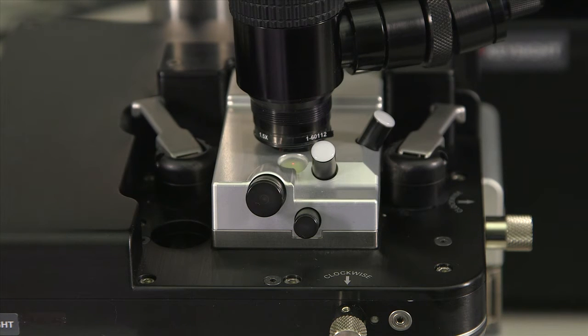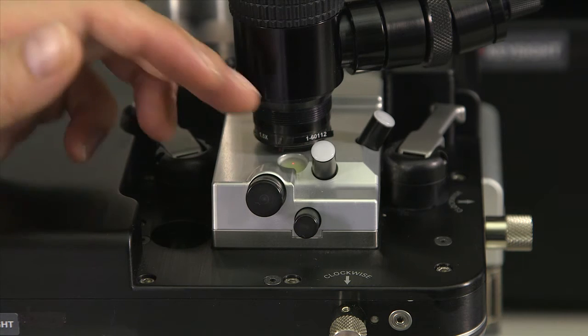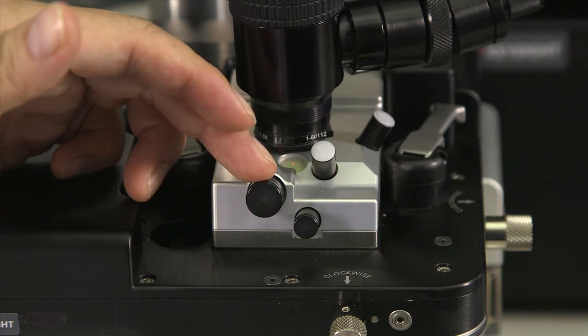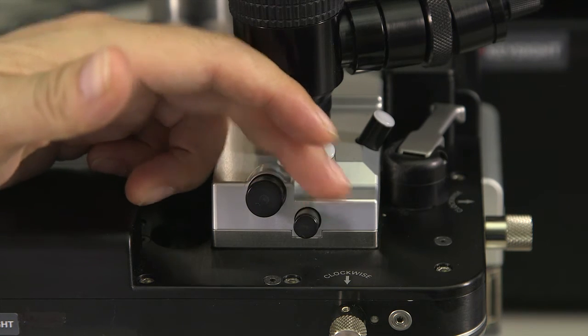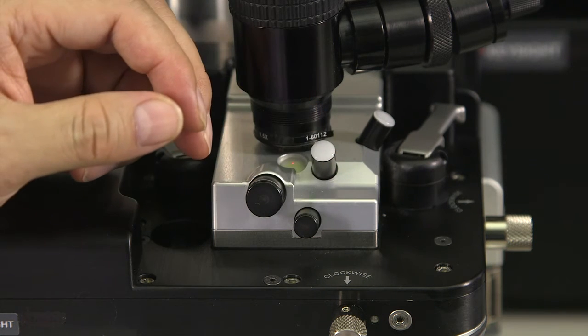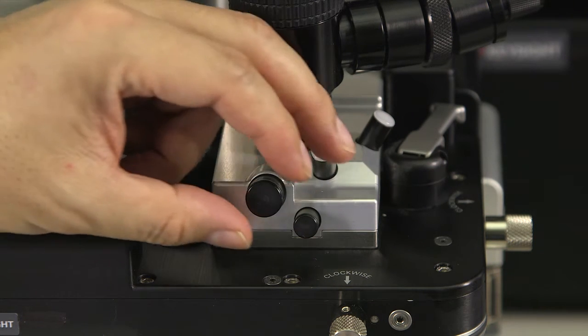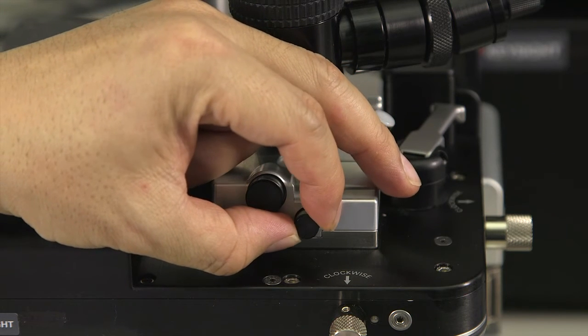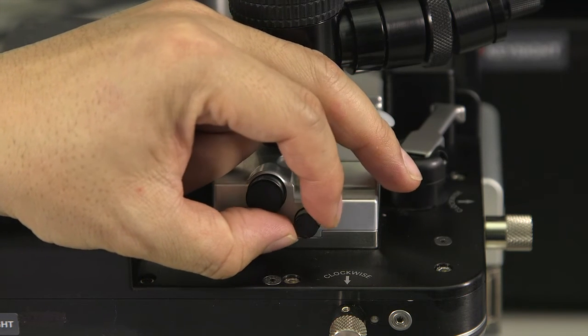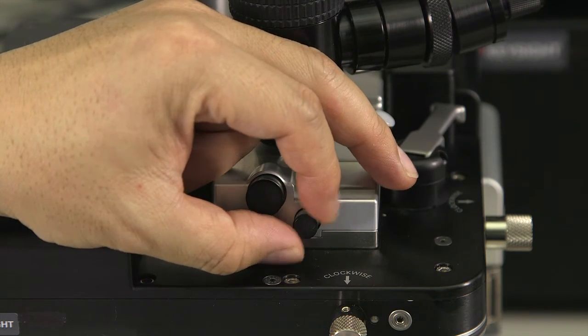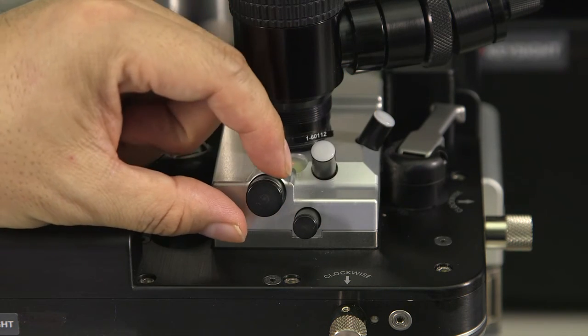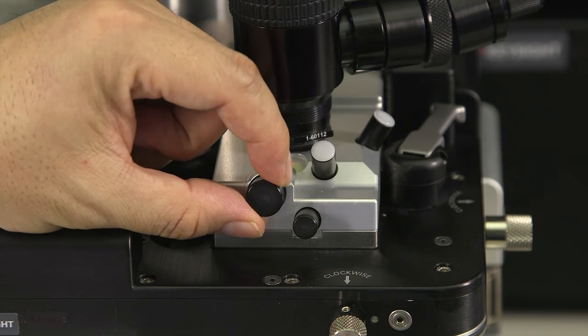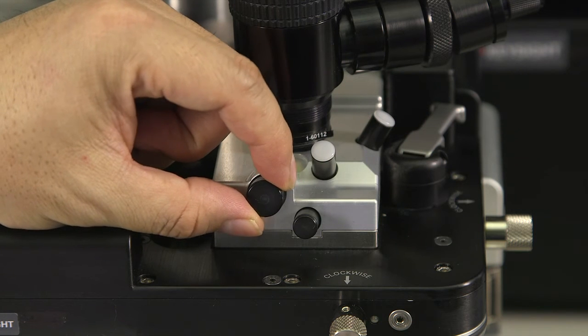In the front of the scanner, there are two knobs, a big one and a smaller one. Remember, the smaller one moves the detector left and right, and the big one moves the detector up and down.